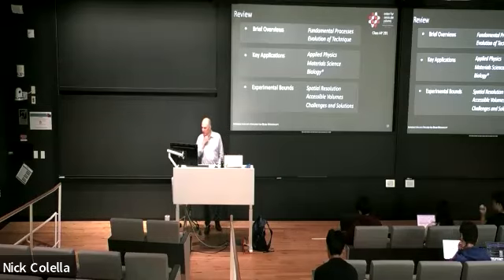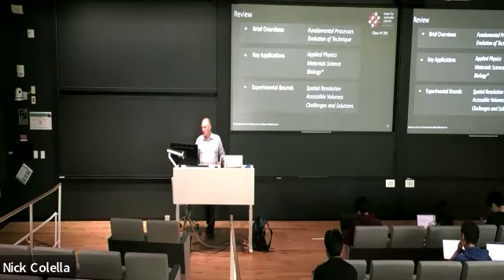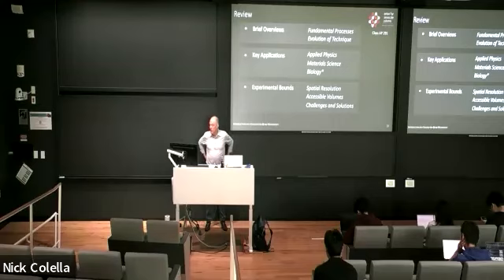There's a question from Deborah about paper samples. Technically, focused ion beam is surprisingly applicable to a wide range of materials, so paper can also be looked at. It always boils down to the dimensions that you need.